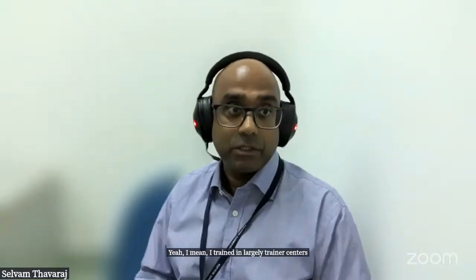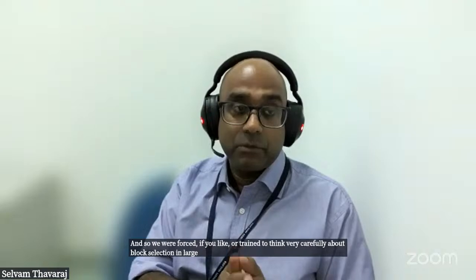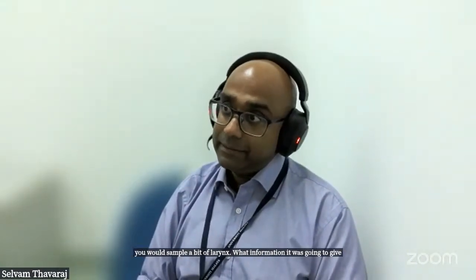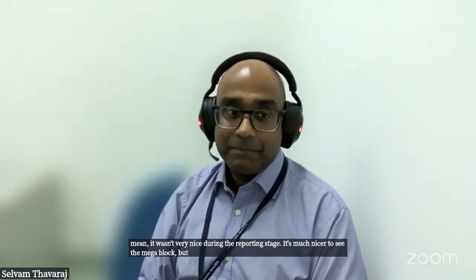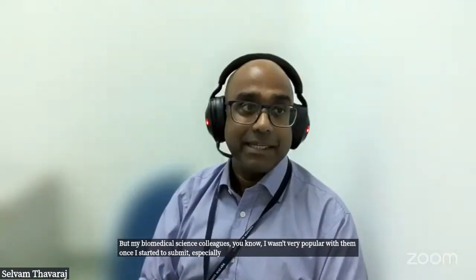I trained largely in centers that didn't have mega blocks, and so we were forced, if you like, or trained to think very carefully about block selection in large pieces, and almost had to justify why you would sample a bit of larynx, what information it was going to give you. It wasn't very nice during the reporting stage. It's much nicer to see the mega block, but my biomedical science colleagues, I wasn't very popular with them once I started to submit them, especially if the larynx is not sufficiently decalcified.